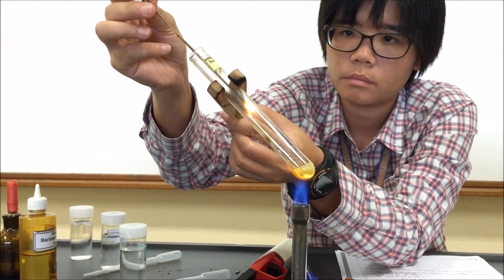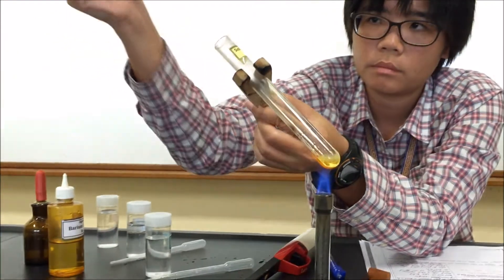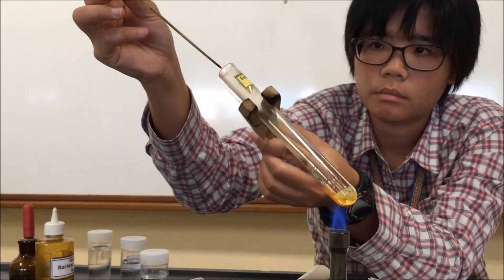You notice that when I place the glowing splint into the tube, the glowing splint does not touch the sides of the test tube. You've got to be careful when you carry out the experiment.